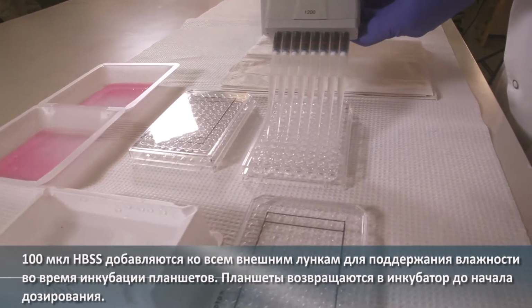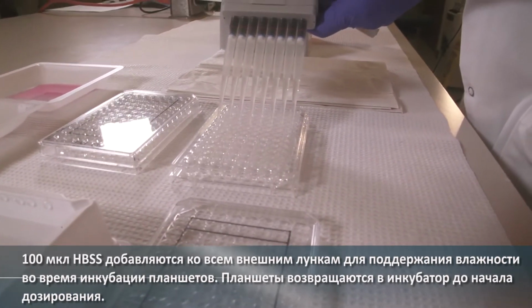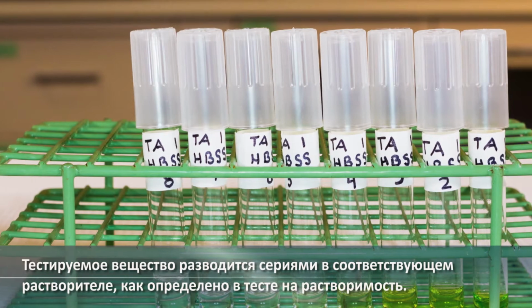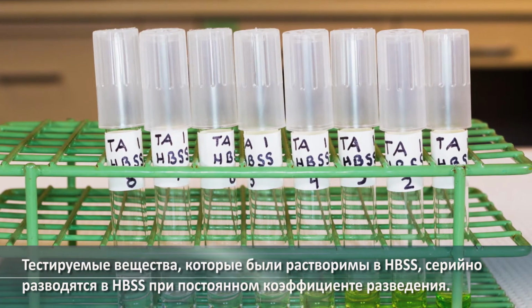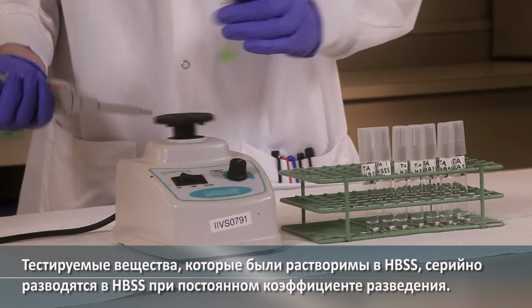100 microliters of HBSS are added to all outer wells to maintain humidity during plate incubation. The plates are returned to the incubator until dosing is initiated. The test substance is serially diluted in the appropriate solvent as determined in the solubility test. Test substances that were soluble in HBSS are serially diluted in HBSS at a constant dilution factor.